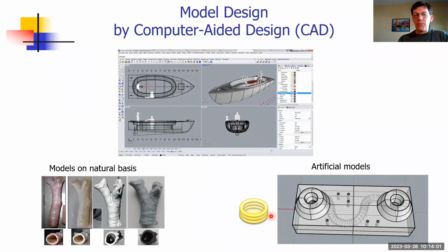And here are two examples I will refer to later on. One is our model, which we currently use for the lung model. I call it the baby pool. And the second is a vascularized model where we have a 3D tissue and we have a vascular structure that is embedded into the 3D tissue, and we have an inlet and an outlet. So we can perfuse our tissue model.